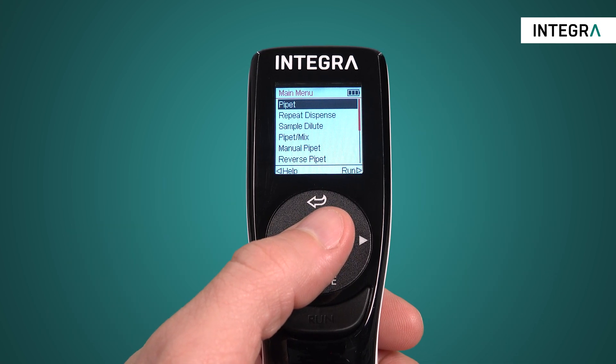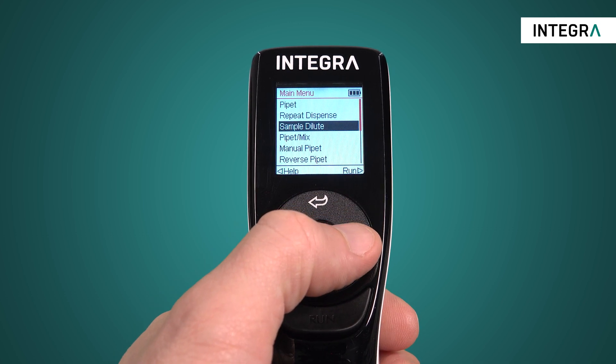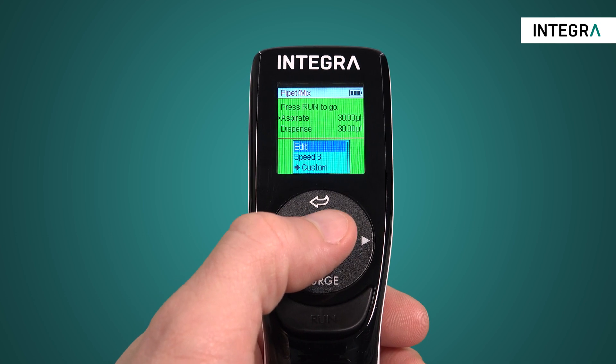To set this up, first enter the program from the main menu. Now we can change the settings of the program by clicking on edit.